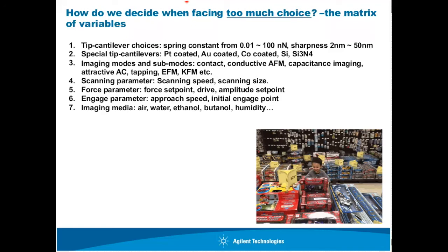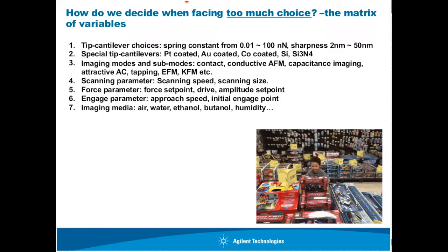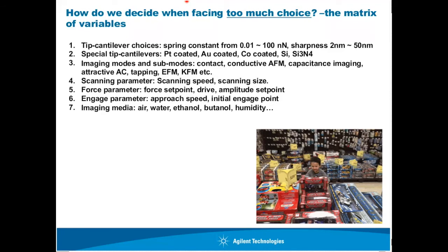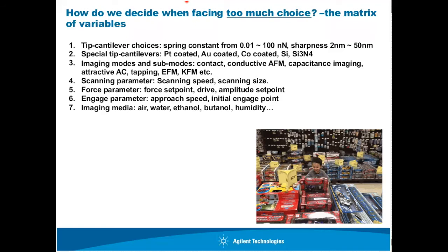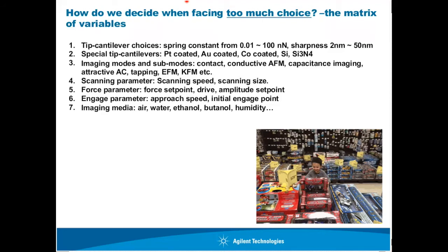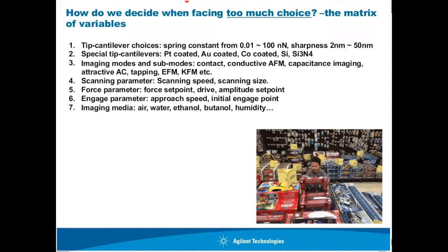After that, the second part of the presentation will give you a lot of case studies, case by case, covering what tip and what parameters I use. So it's much easier for you to compare your sample to the closest sample that I presented, and then take my suggestions into consideration.